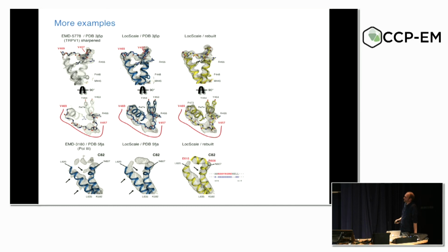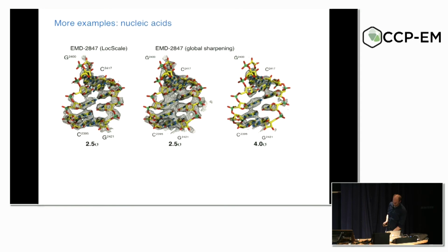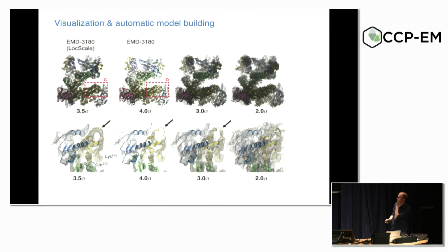And if you look at secondary structure predictions, indeed, it seems that there is a predicted helix at that position that you can possibly extend. I'll skip over this as well. Just come to the last point I want to make, that such locally scaled maps may help you to build your model, but they may also help you in a very simple case of just displaying your model.